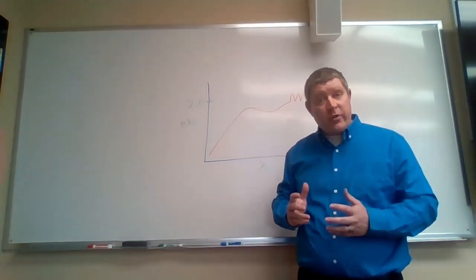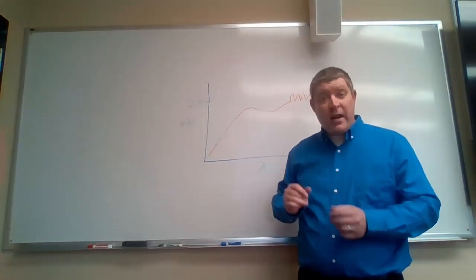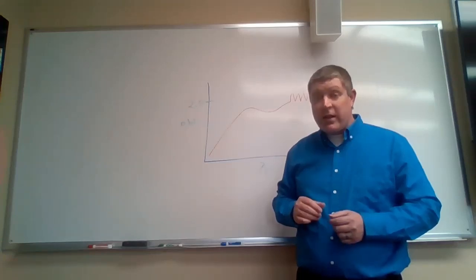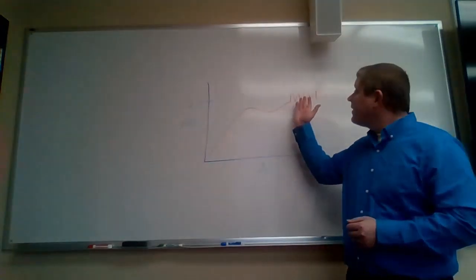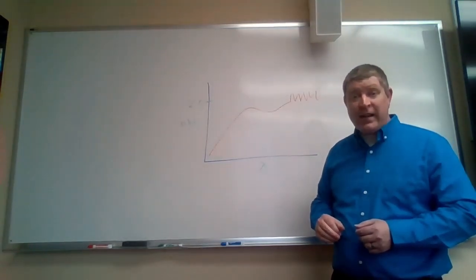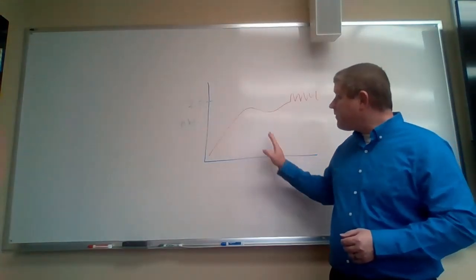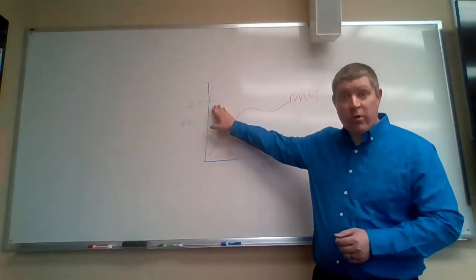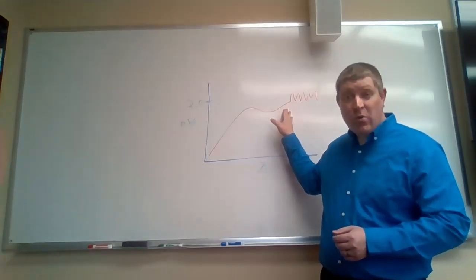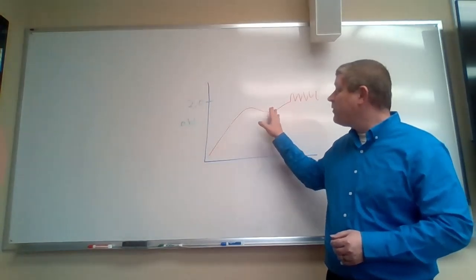And with our SpectraViz spectrometers, these are not super high-end devices. And when you've absorbed 99% of the light, that means there's not much left. There's only 1% of the light left. And so beyond that, it's just really, really difficult to measure any light that's remaining. And so do not pick a wavelength for which the absorbance value is over 2.0. Once the SpectraViz gets to about 2.2 or 2.3, you just get lots and lots of noise. So we don't want to include any values that are over that.